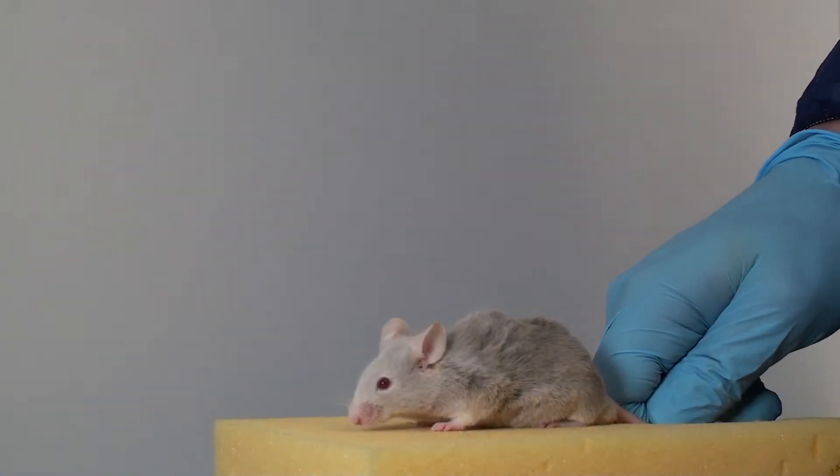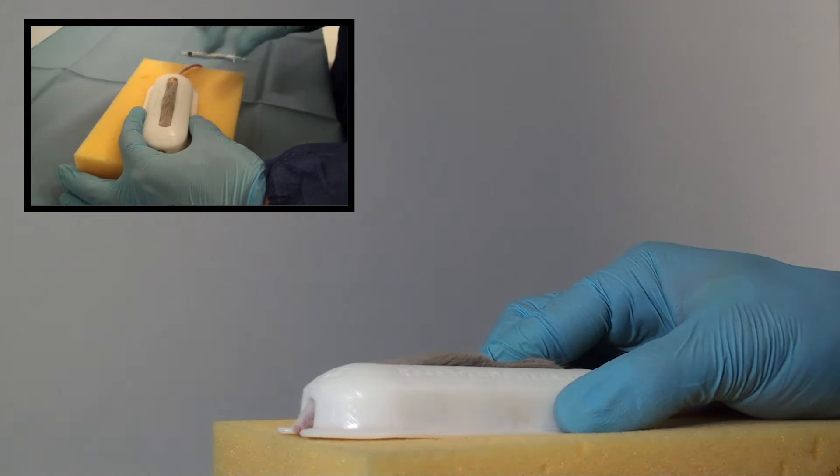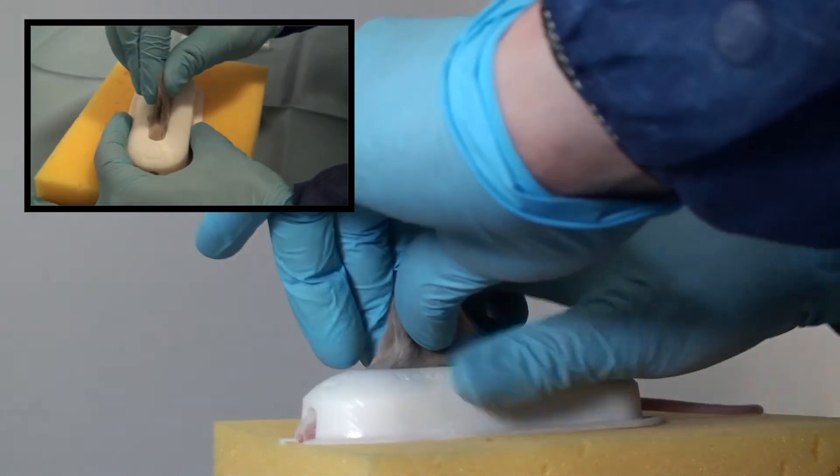The mouse is taken from the home cage and placed onto a soft foam base. The ScruffGuard is then placed over the mouse so that its fur protrudes from the central slot and the scruff can be grasped without injury to the mouse or handler.